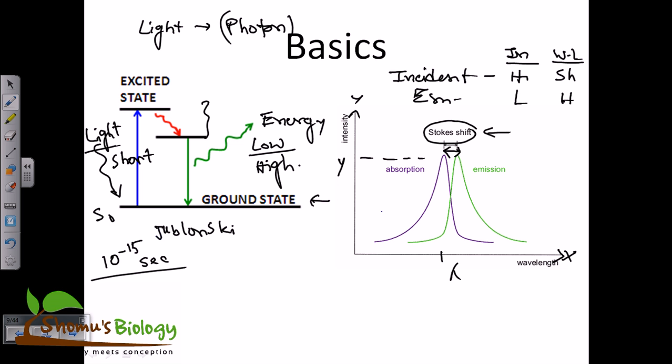So these are the two basic concepts of any fluorescence microscopy, right? If we begin with fluorescence microscopy, one basic type is called wide field fluorescence microscopy. Besides that, there are other modifications of fluorescence microscopy. There is an evolution of fluorescence microscopy, because wide field microscopy was modified into what is called confocal microscopy. Remember, all of these types are fluorescence but slightly modified. Again, there are certain problems in confocal, and to solve that, there is another kind called two photon microscopy, right? So these are all the different types of fluorescence microscopy.